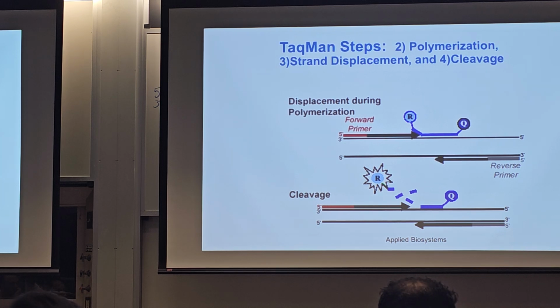Really efficient. So the reverse primer, does it hybridize to the probe? No, the probe only hybridizes on one of the two strands. So for every double helix that you copy, you make one. Okay? For every double helix we copy, we make one.